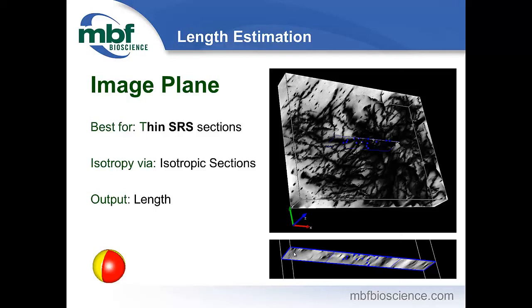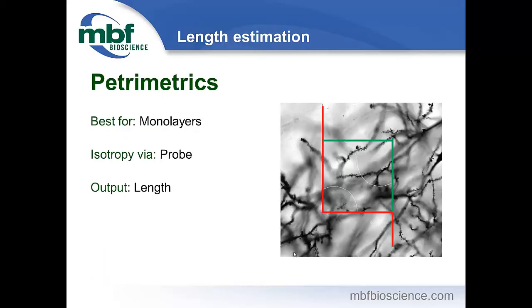In most cases, I think more so than cells, it would be safe to assume that most fibers do have a preferred orientation, even if they were blood vessels in a tumor. Especially in the brain, a lot of times you're not going to know that, so use the thick tissue and use the sphere. The probe itself is isotropic. If you do use thin tissue, you have to make the tissue isotropic. That's why we have the spinning beach ball at the bottom.